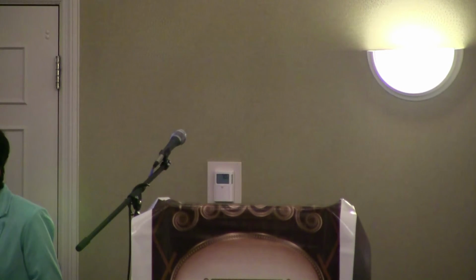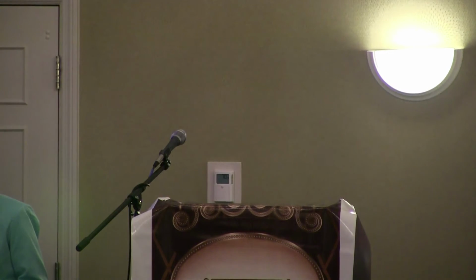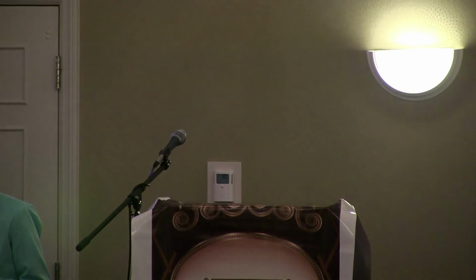Okay, thank you. It's a very interesting talk. Did you only use the negative mode electrospray ionization as the ionization method? Yes. Because that will not ionize any saturated hydrocarbons.